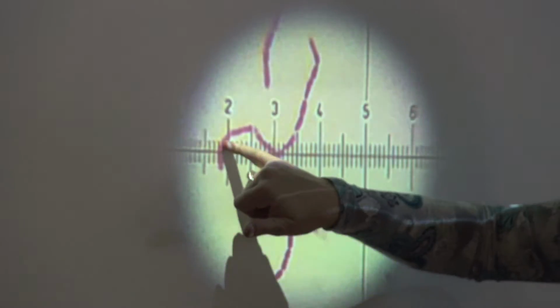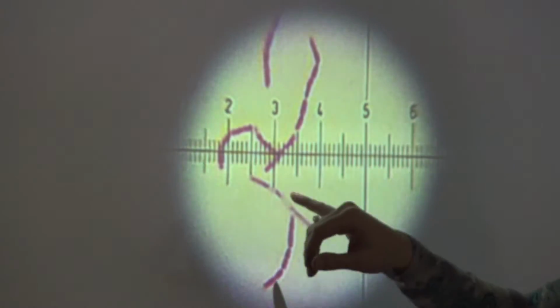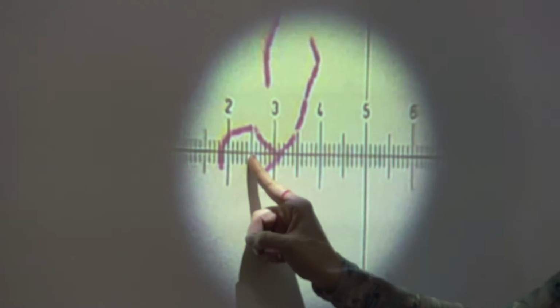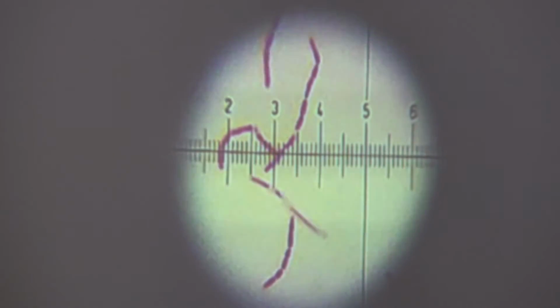So at 1,000 times magnification, our ocular micrometer is set so that 1 micron is equal to 1 tick. So you can see the bacterial chain right here. So here's 1 bacteria, 2, 3, and maybe 1, 2, 3, 4, 5 coming up in this direction. So if we count how many ticks, and they're the small ticks, this bacteria here it's 1, 2, 3, 4, 5. If it's 5 ticks long, and you multiply that by 1 micron per tick, we have an estimate that this bacteria right here is approximately 5 microns long.